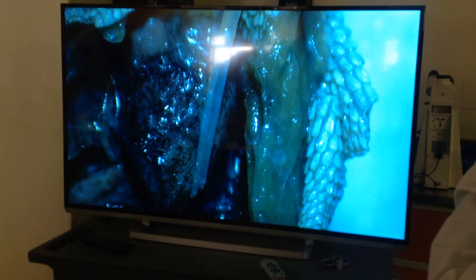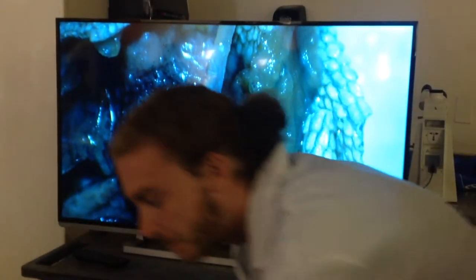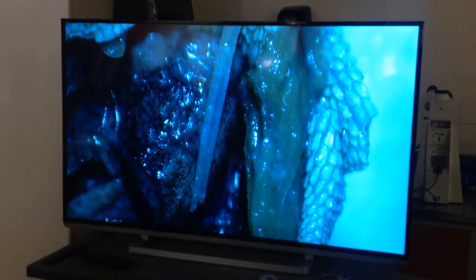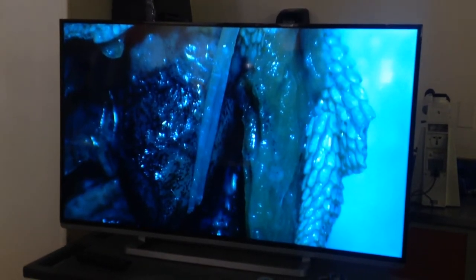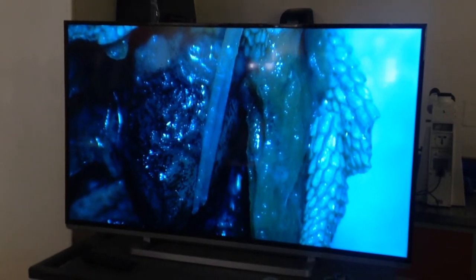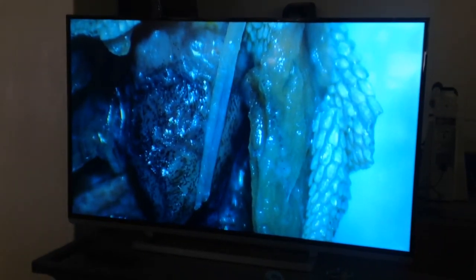This is a lot easier to see when you're using the actual dissecting scope, because the camera itself zooms in on what the dissecting scope sees. So right now, looking through the dissecting scope, I can actually see about a quarter of the animal as opposed to just one small part of it. It doesn't zoom out anymore — it always looks in from there. But if you use the dissecting scope, you'll be able to see it.